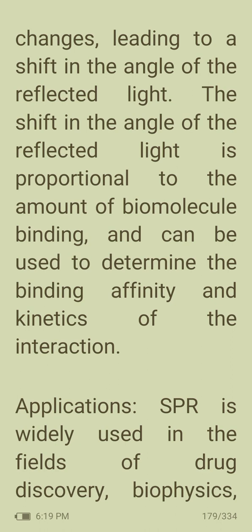The shift in the angle of the reflected light is proportional to the amount of biomolecule binding, and it can be used to determine the binding affinity and kinetics of the interaction.